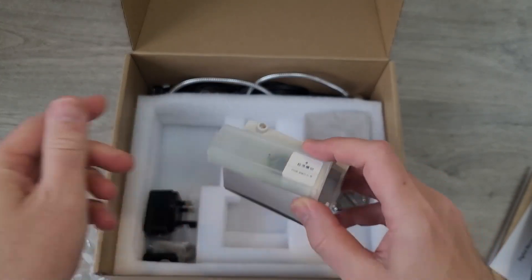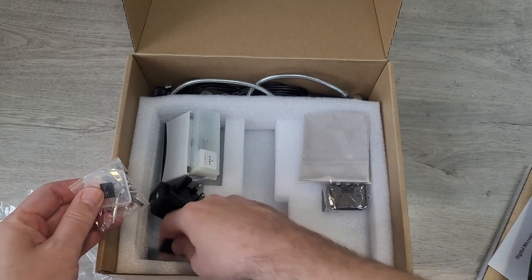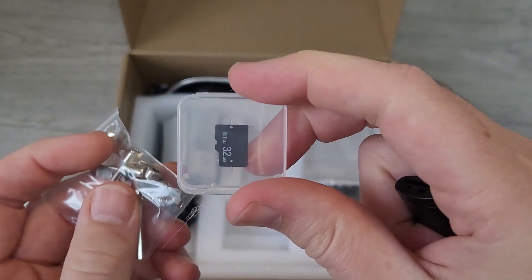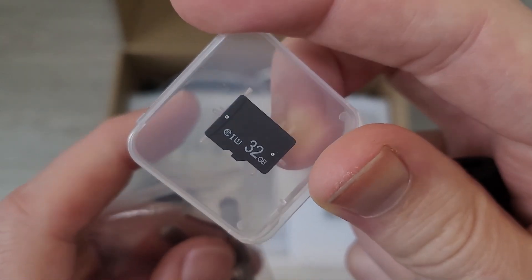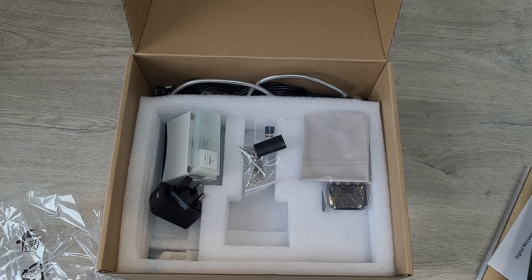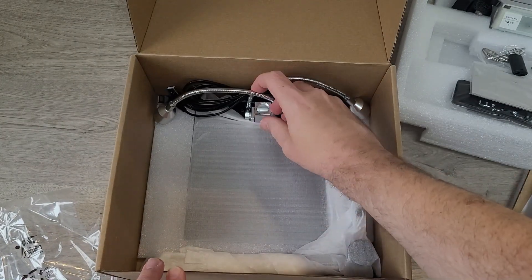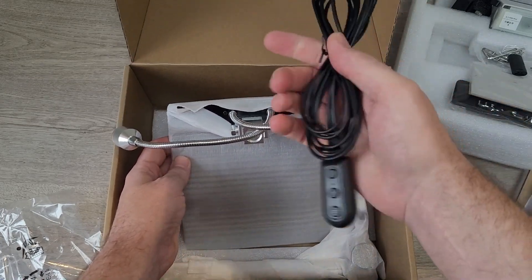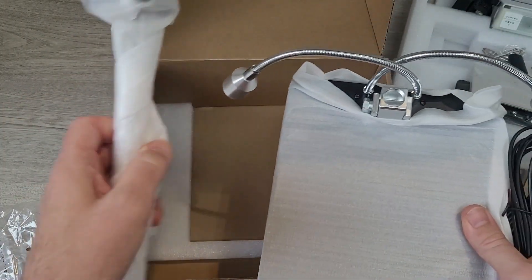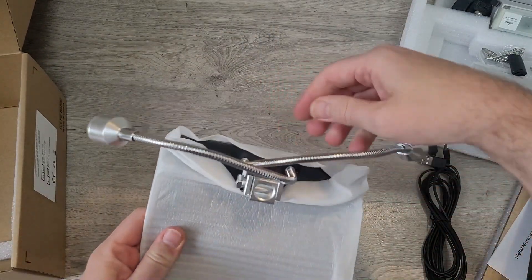We've also got a cleaning cloth, a little box, and some slides to have a look at. Then there's a plug, an SD card, and an SD card adapter for when you plug it into your computer — a nice 32 gig card. Underneath we've got a big base, the wires, and the back pole, all in a nice protective wrap.